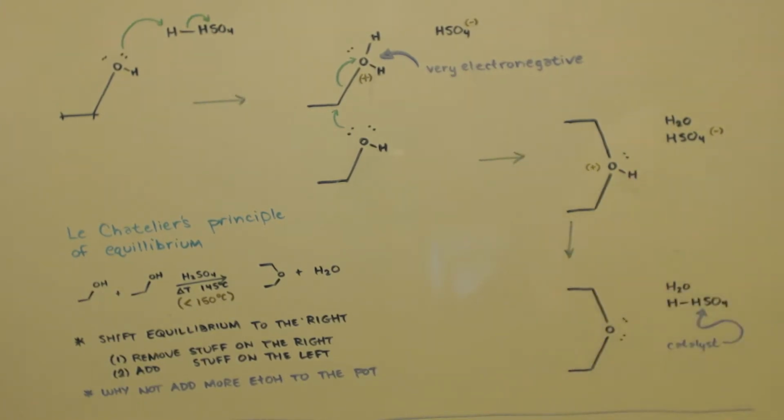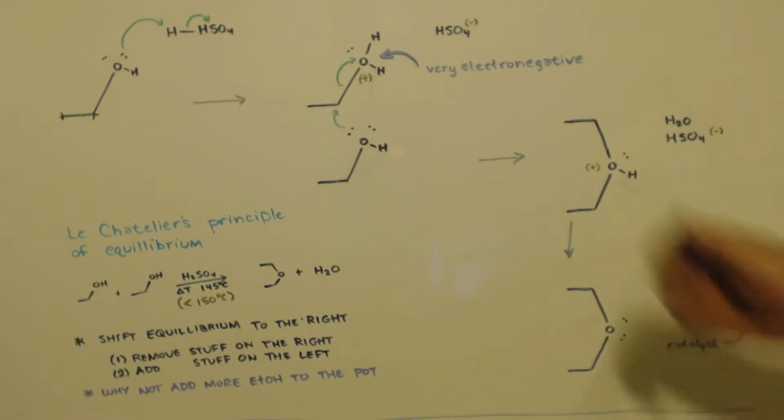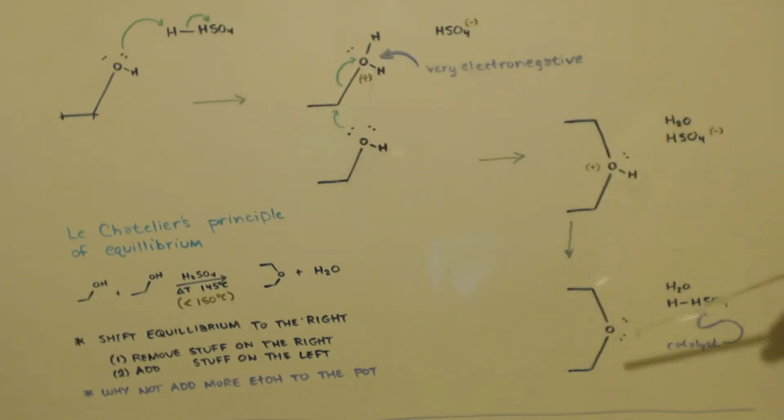I made 1,4-dioxane or 1,4-dioxycyclohexane, whatever you want to call it, either one. It was the same way. It's an ether. And I made it the same exact way, with the same mix. You should watch that video if you're interested in symmetrical ether synthesis. If not, don't worry about it. If you're just into watching this ether, then just watch the ether, diethyl ether. So anyways, let's get on with this.